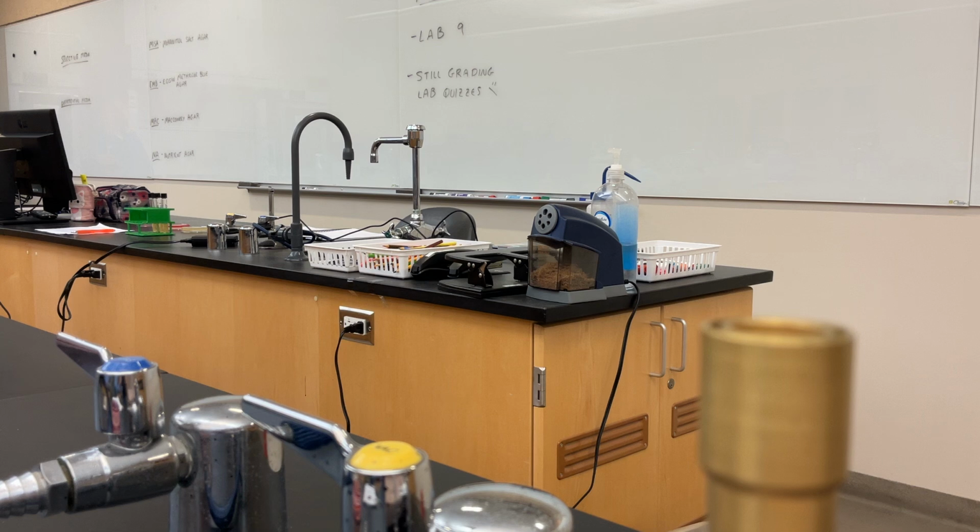Grow just our target organisms, or at least get that target group smaller. To do this, we need a couple of different types of media. When we work in the lab, when we get a urine sample or a throat swab, we're going to set up some different types of plates. We're going to set up some that are called selective media and some that are called differential media.